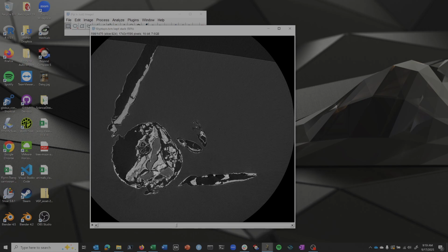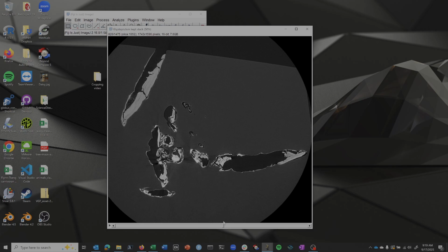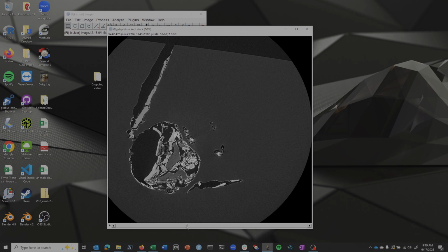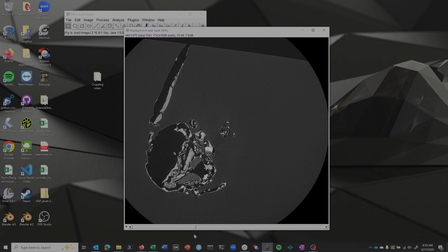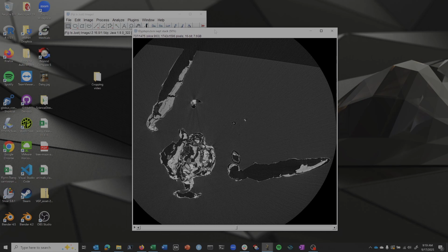Also, if you want to do volume rendering, loading this whole file into the GPU memory of a video card, if you're using an NVIDIA style card, can take time. And also, if it's greater than 16 gigabytes, there are a lot of consumer level cards that are not super expensive that only have a maximum of about 16 gigabytes. More expensive ones can have 24, but the smaller your volume file is, the easier it is to do volume rendering or really any other operation. So hopefully this is useful.